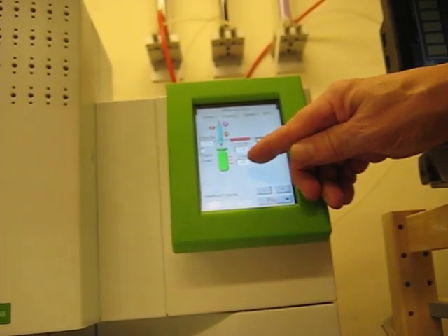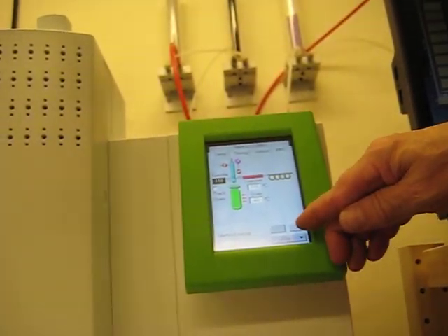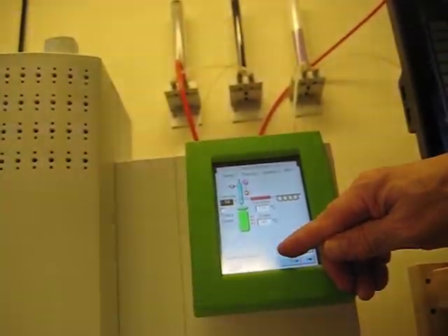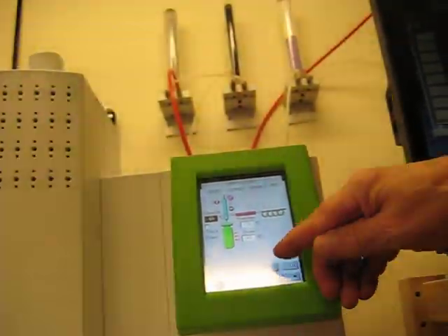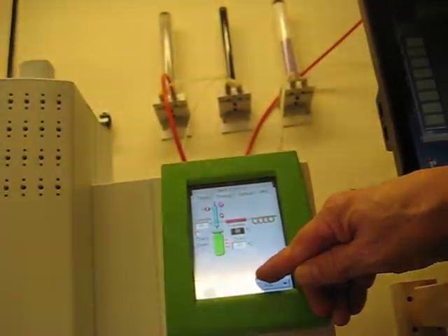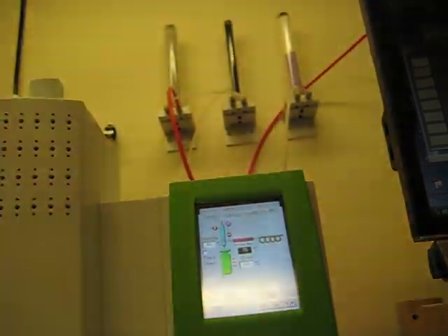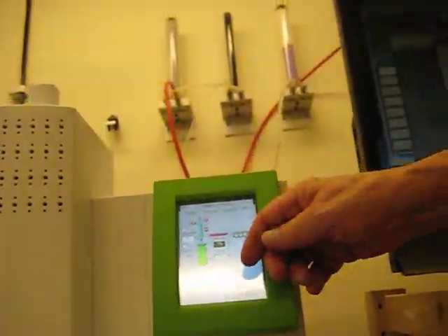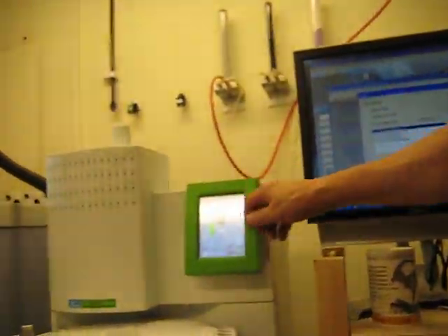So let's guess. I would guess 60 for oven, and I will do it by the book. So go for 65 there, and 70 there. This method is not very critical. But as I said, there can be cases where people put 100 there, even though, according to theory, they should not use it.